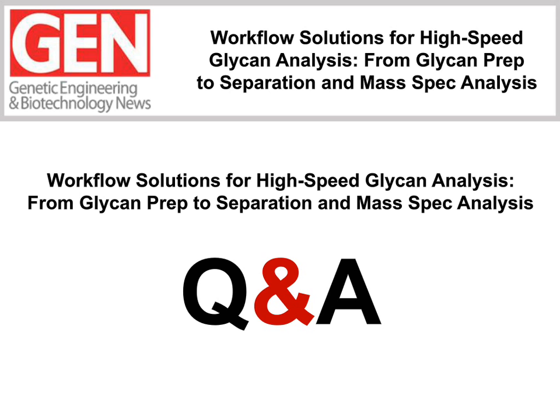A low number of samples, somewhere around, say, 96, can on average be completed in about 2 days from both release to labeling. However, if you're looking at larger sample quantities to process, I would expect extended periods of time, perhaps upwards of 4 days.